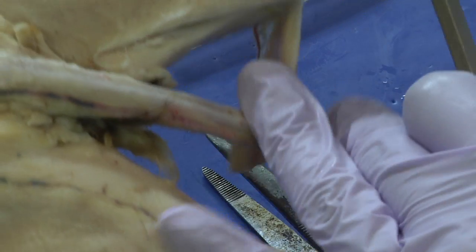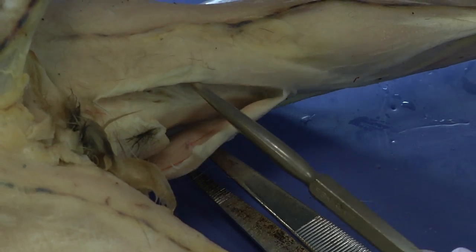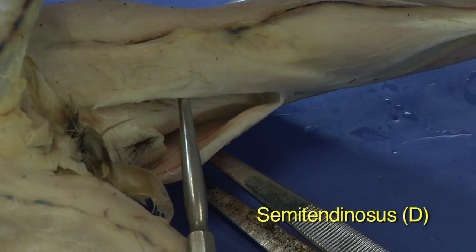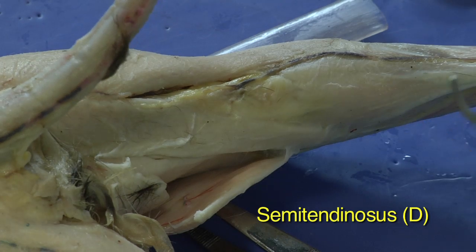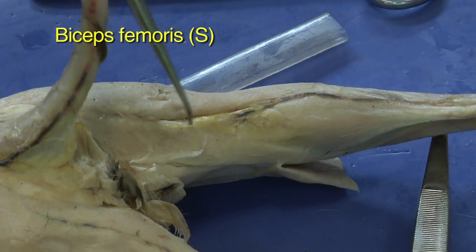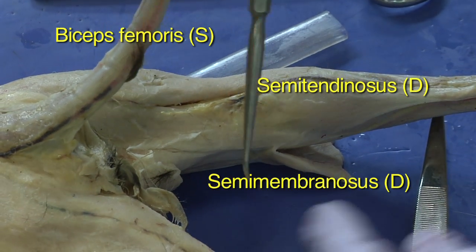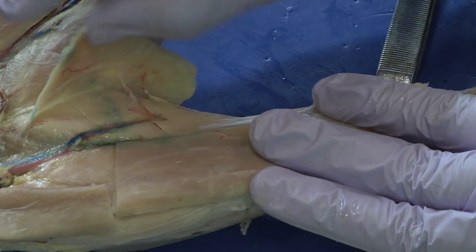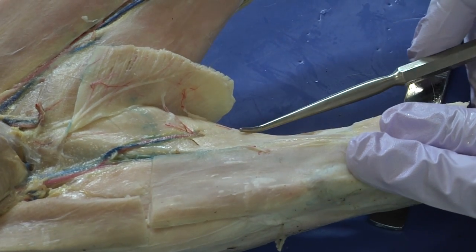All right, so if the tail can get out of the way there, maybe I can lift it up. You can see this is the semitendinosus. All right, so the three muscles that make up the hamstring, we have the biceps femoris here on the side, the semitendinosus here, and then you can kind of see the semimembranosus from the dorsal view, but the ventral view is far better. And it is the bottom muscle here. All right, so those three muscles make up the hamstring.